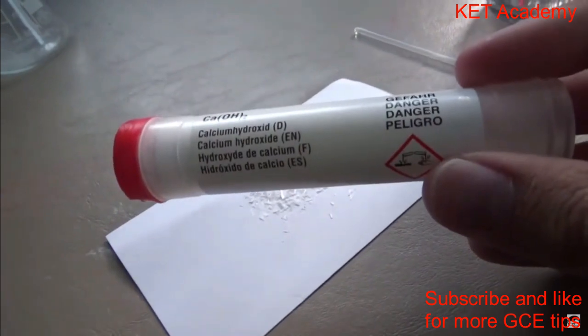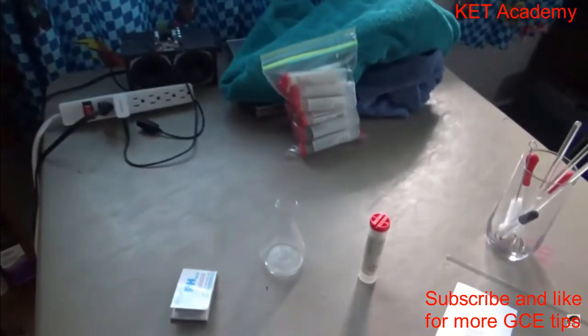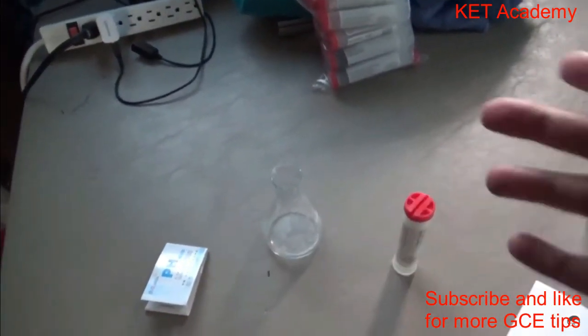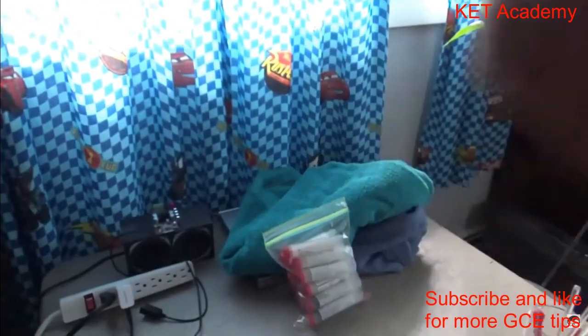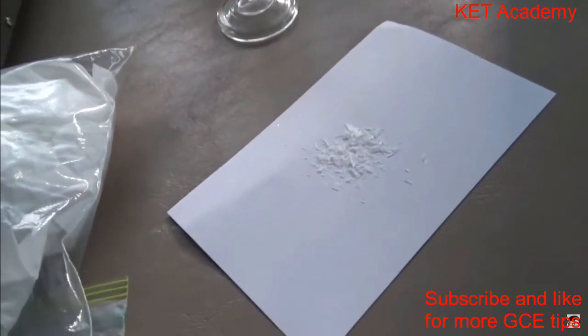So I've got some calcium hydroxide here. What we'll do is bubble the gas produced by this into a lime water solution. If it turns milky, that means there's carbonates present because of the carbon dioxide. So I guess if you have something similar and you want to figure out what your crystals are, this could work for you as well. If you pay attention and follow through, you'll probably get to some decent conclusion.